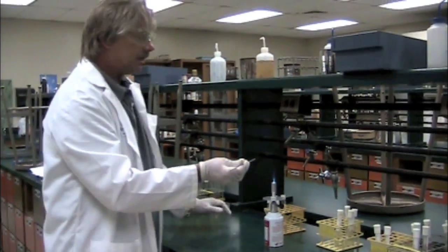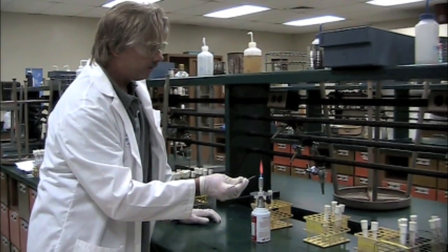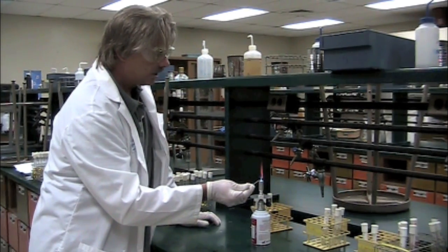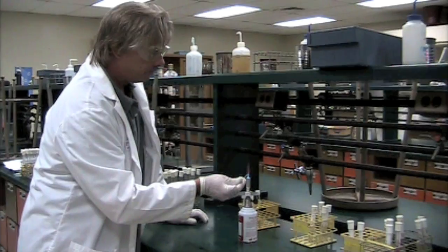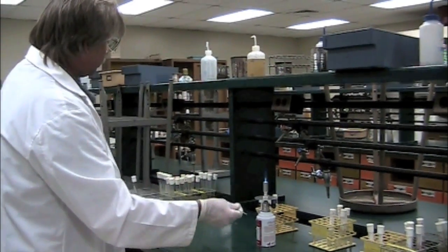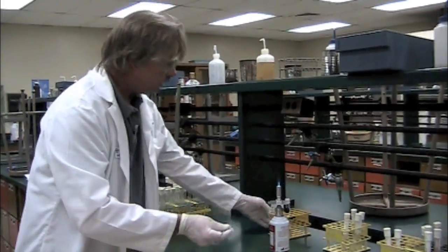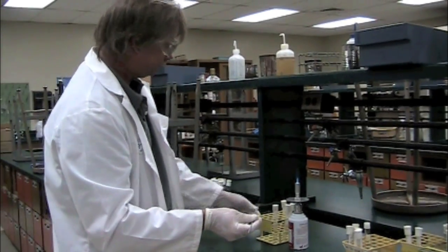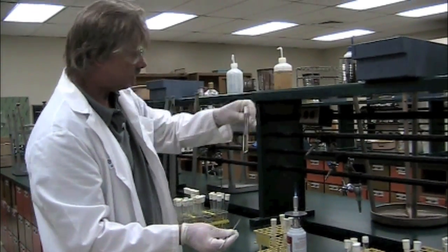Okay? The last thing I need to do in order to complete this particular process is reflame my loop. I want to make it red, completely red. That means that everything is dead. Not even a spore can withstand this kind of heat. Okay? So, the next thing I want to do is you guys will be using some E. coli broth. So I'm going to get my E. coli organism here. And here's a broth tube.